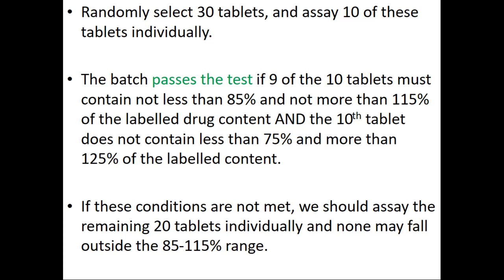The 10th tablet does not contain less than 75% and not more than 125% of the labeled content.